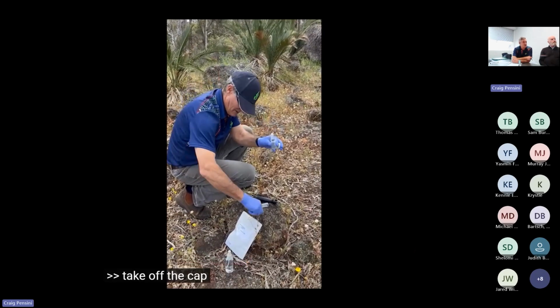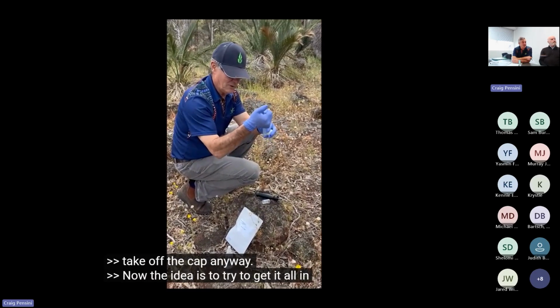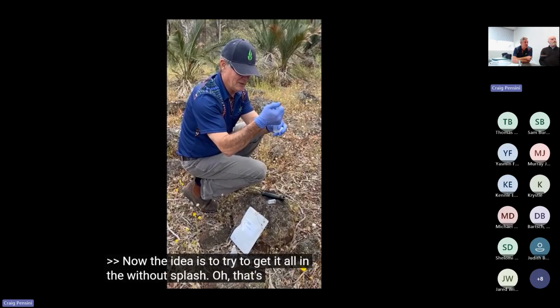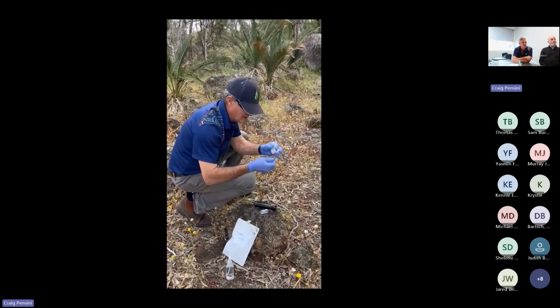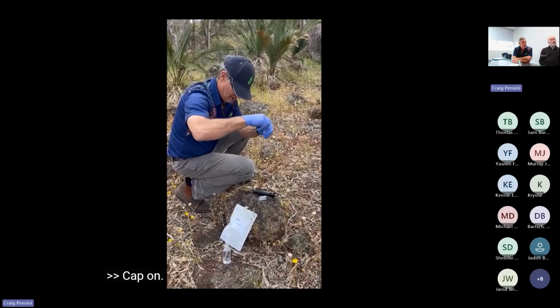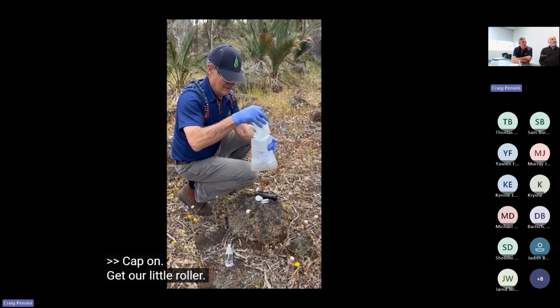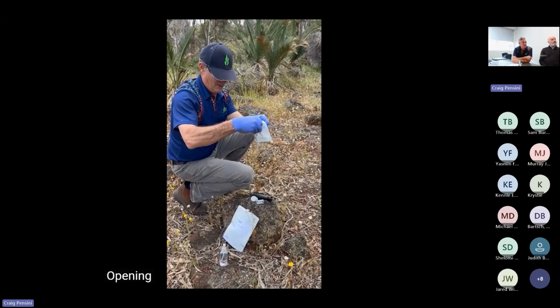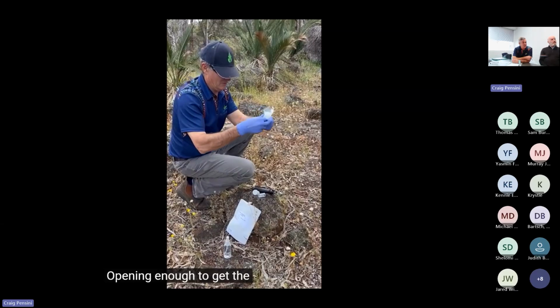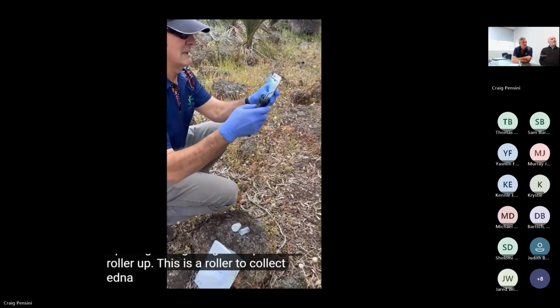So this is the terrestrial sampling. There's a little bit more involved here in getting the kit set up. So this is actually prepping everything. This is a solution that goes into a little vial. So that goes to one side. Then we reach in and get our actual roller out, which is in its sterile packaging, and that's got to be attached to the handle.